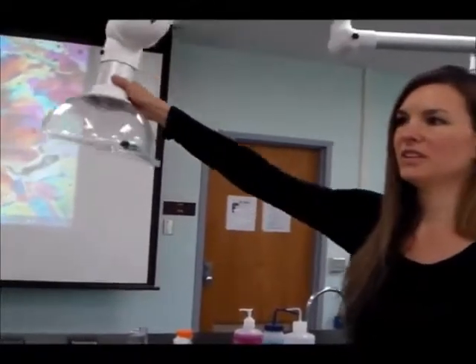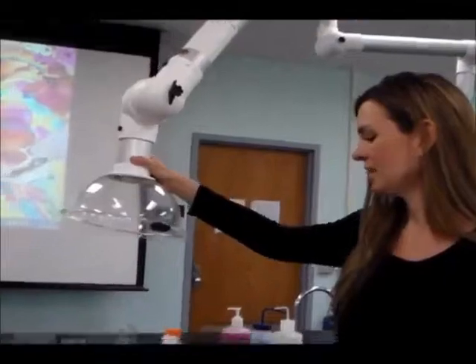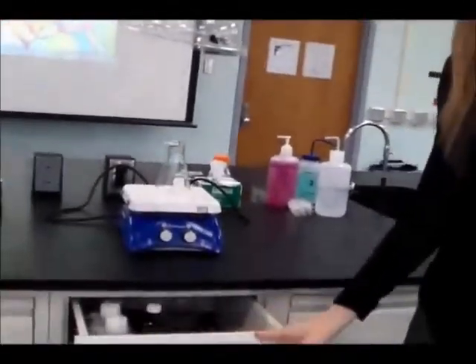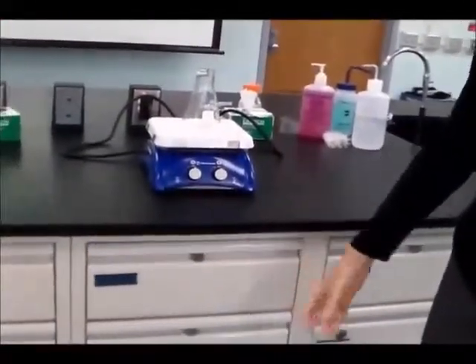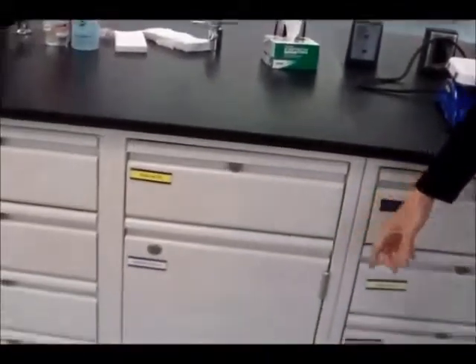Another safety feature is our elephant fume hoods. Students have a drawer for storage for their glassware and accessories and a student drawer for their belongings.